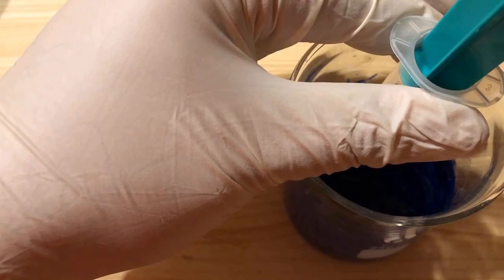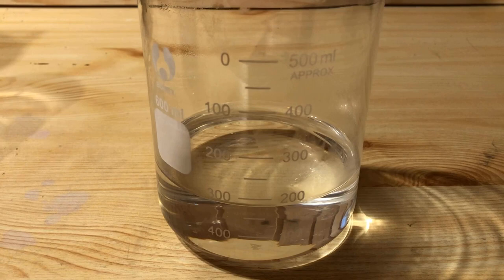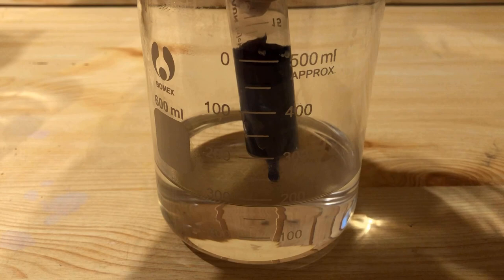The viscous solution is now filled into a 20 milliliters disposable syringe. The opening of the syringe is dipped into the prepared sodium hydroxide solution and a uniform pressure is applied to the syringe plunger.